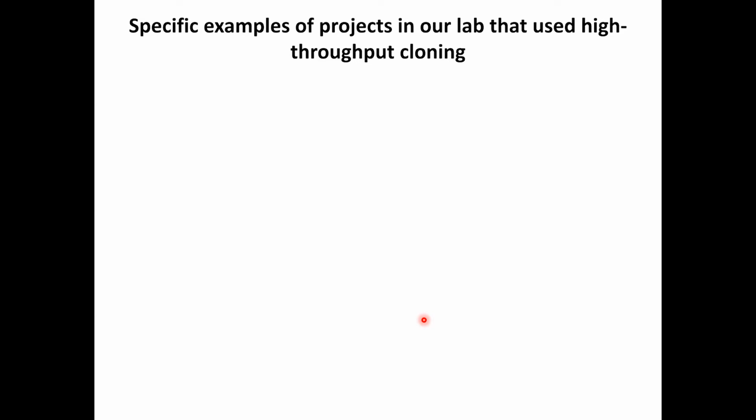Great, thank you. And we have one other question here, which you may want to address now, or you may want to save. What are other cloning methods, and what are the advantages of cloning with CRISPR-Cas9 over other methods? Sure, so there are certainly other cloning methods. As mentioned, the goal is to put 2 pieces together, or multiple pieces if you can.